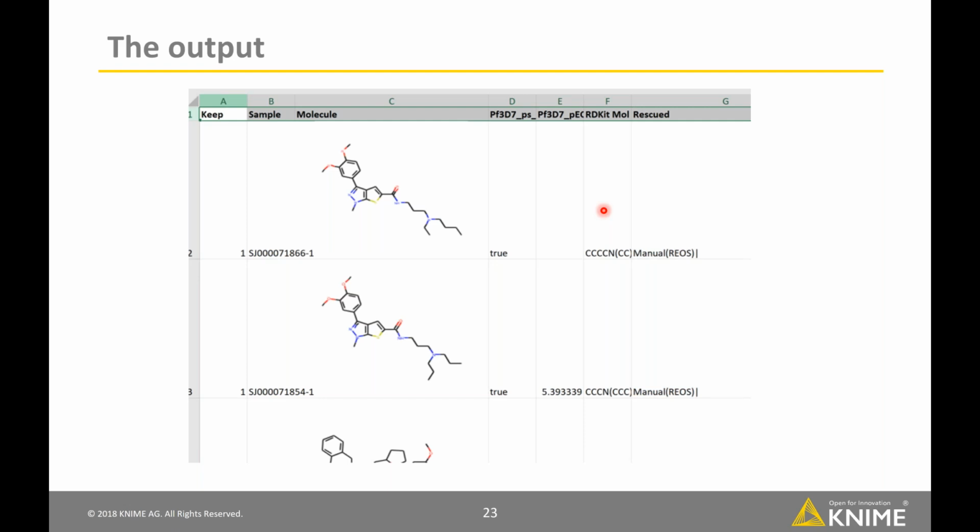That's a very good question. I didn't have to look too hard to find centroids that had reasonable neighbors, and I think that's a property of this particular data set. There were 1,500 hits, which is a good number. You don't often get that many hits. There were enough chemical series in the deck that was screened that this actually worked. But it's a great question. It is certainly not always the case that this would be true.